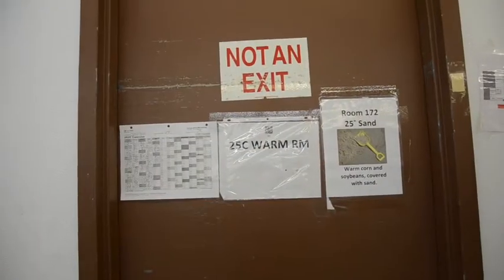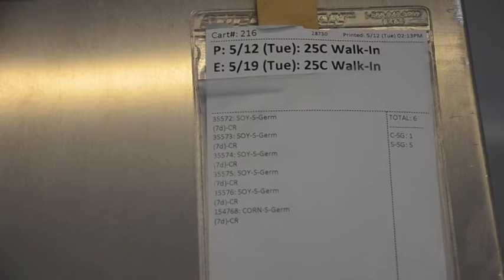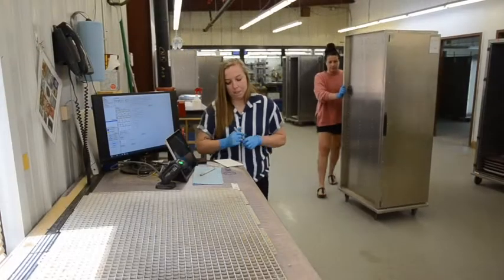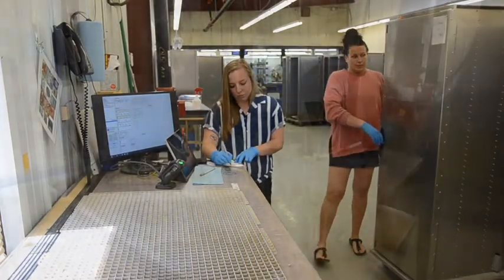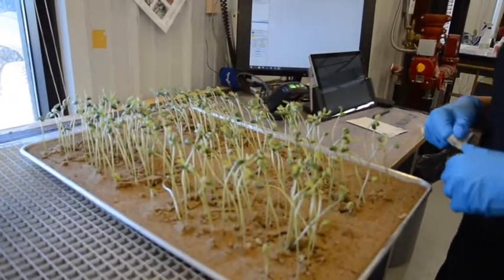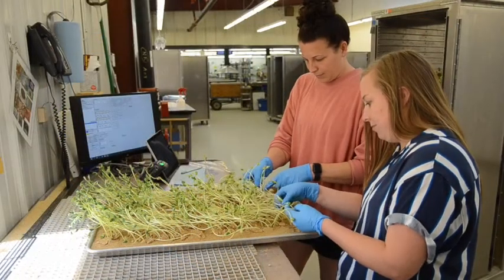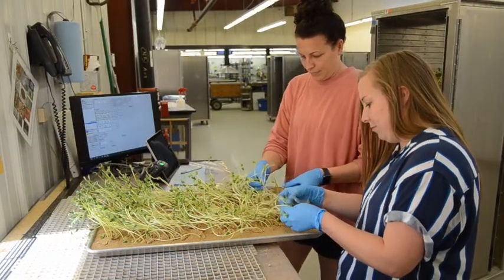Samples are placed in carts and they go into our 25°C warm room for seven days. Our system is automated, so we can scan all samples into carts and it prints the tag out notifying us when we need to evaluate each sample. At the end of the day it also tells us if we missed any samples for evaluation. We scan each QR code and it brings up the sample number that we're evaluating, which helps us to reduce errors in the laboratory.